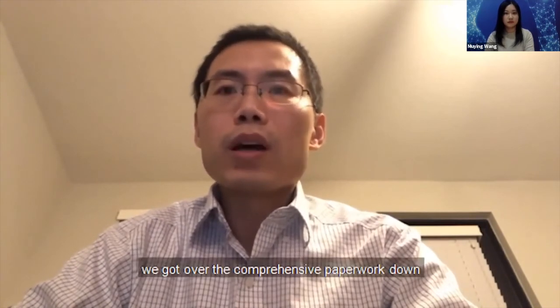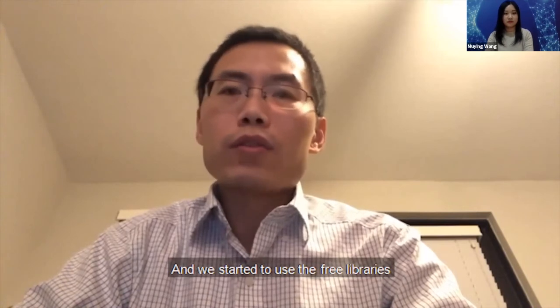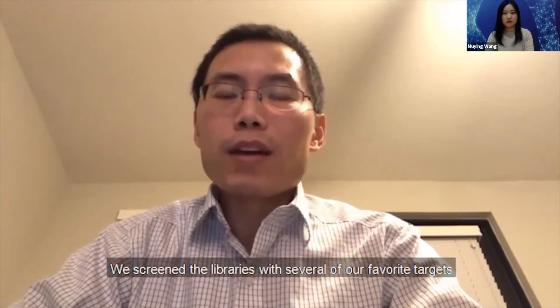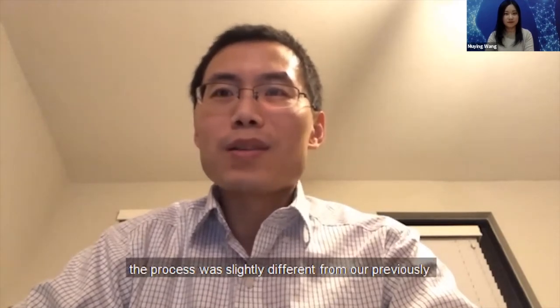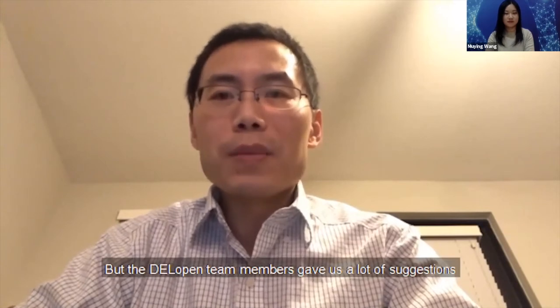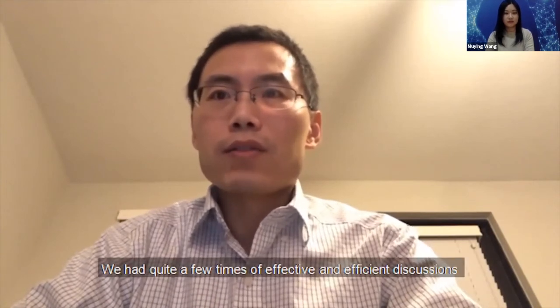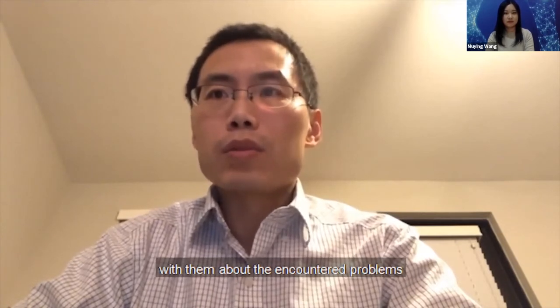Briefly, we got the comprehensive paperwork done, and we started to use the free libraries. We were lucky to be the first batch of users for the distributed libraries. So we screened the libraries with several of our favorite targets. I have to say that in the beginning, the process was slightly different from our previously oversimplified idea about how the screening should go. But the Del Open team members gave us a lot of suggestions. We had quite a few effective and efficient discussions with them about the encountered problems.